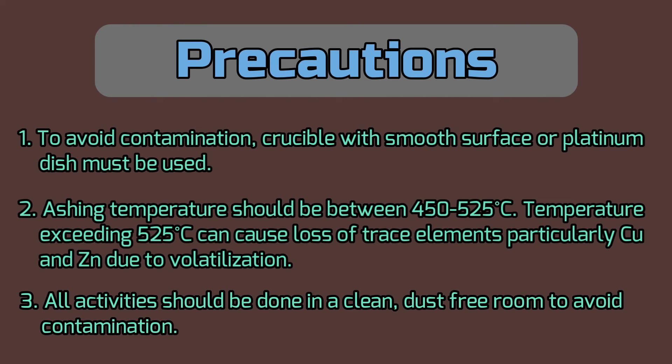Some precautions should be followed throughout the sample preparation. To avoid contamination, crucible with smooth surface or platinum dish must be used. Ashing temperature should be between 450 to 525 degrees Celsius. Temperature exceeding 525 degrees Celsius can cause loss of trace elements, particularly copper and zinc due to volatilization.